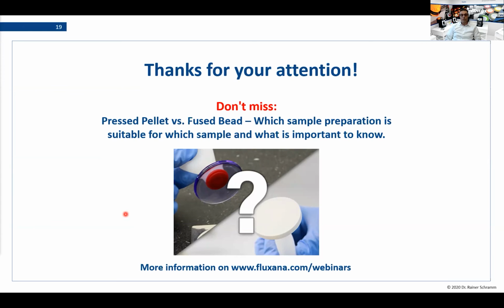And this is the reason why we have to set our energy profiles properly so that we collect the intensity in a good way. So even if the peak shifts a little bit to the left and the right, it will be recorded correctly and we still get the same intensity. And also the drift correction will help us to adjust this over time. And it's clear, the older an instrument, the more we will see these effects.